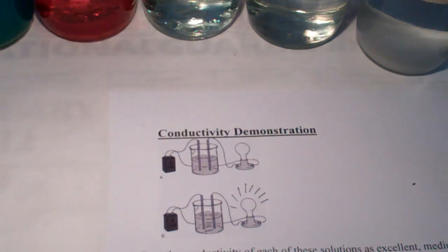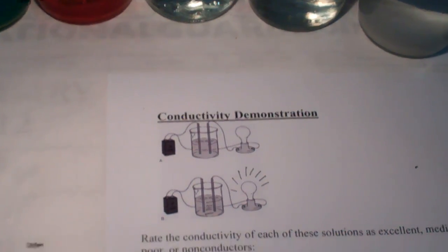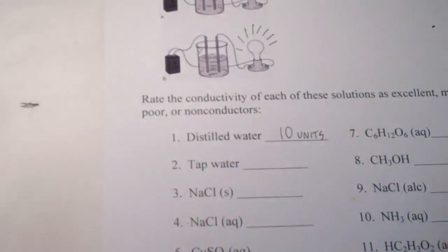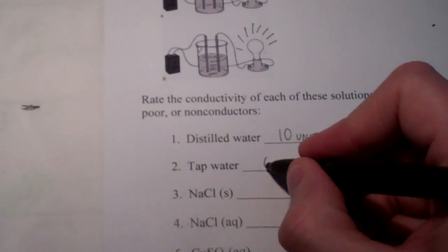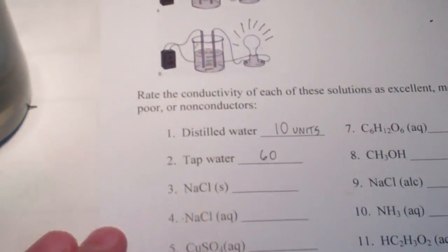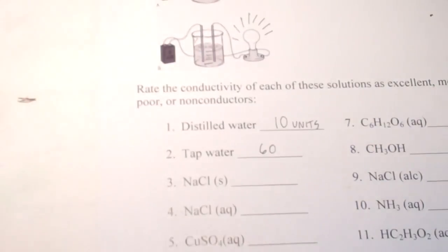Okay, let's try tap water, and see if that conducts any better, or maybe worse. So, here's our tap water. Place our conductivity meter in. We'll press low to begin with. It says ten plus. So, now we'll press our high button, and it says seven. Oh, now it says six. So, we are going to go with sixty. So, our tap water conducts at sixty units. So, there must be something in that tap water that will promote the conductivity of electricity from one electrode to the next.